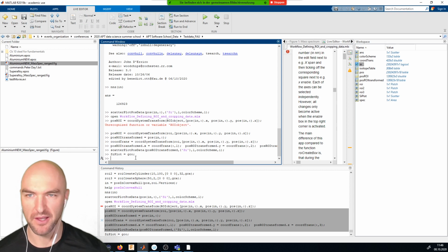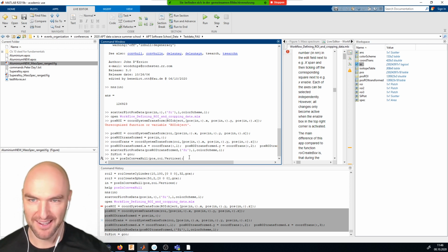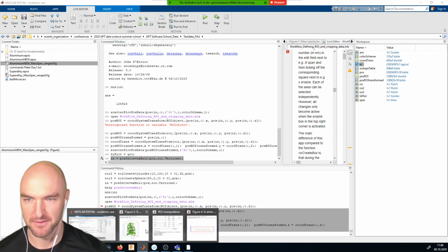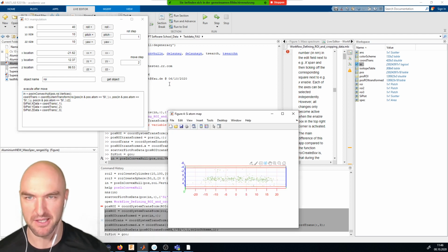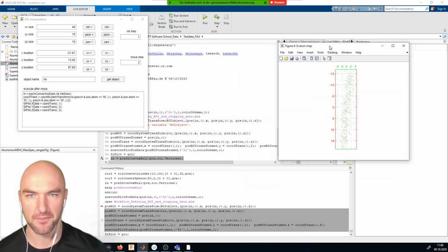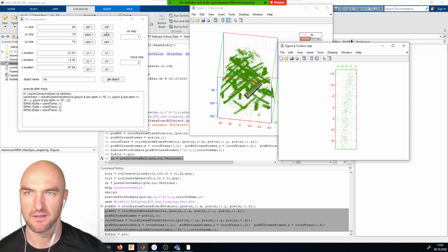Oh, and one thing I've totally forgotten is that we should probably redo the convex hull test as well. So copy that. Now I've never changed which atoms we're actually working on, and I was wondering why the box doesn't move. The box doesn't move because we didn't rerun the containment test. Now it actually reruns the containment test. Okay, which means we probably should realign everything from the top as well.